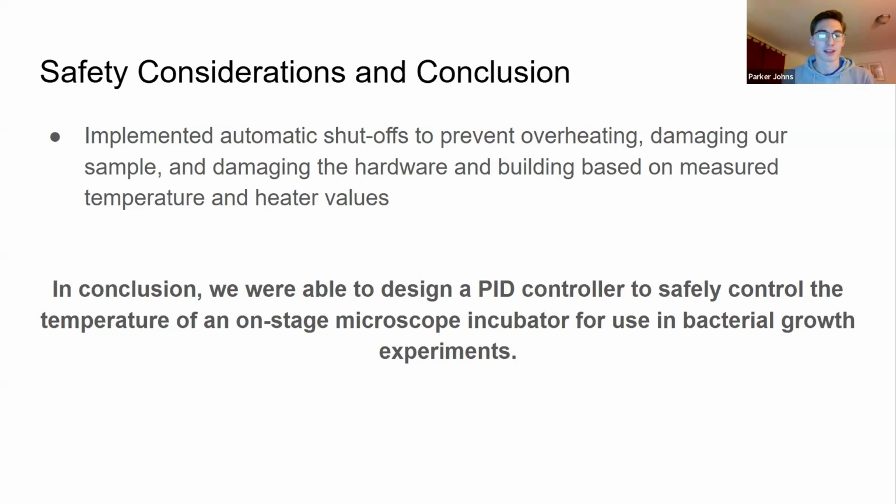And now to end, we'd like to make you aware of the safety considerations we took into account when designing our incubator. We implemented several automatic shutoffs to prevent overheating, damaging our sample, or damaging the hardware and building based on the measured temperature and heater values. So if the temperature ever exceeded 50 degrees Celsius, the incubator would automatically turn off, and the heater value is never allowed to exceed 50% power output.